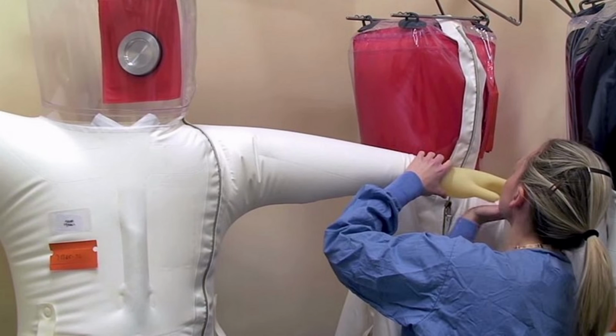Alternatively, this is where those jumpsuits come in. It's a full-body suit with air supply going into it, and there must be positive pressure. This means the suit is constantly being pushed out and away from your body. If, for any reason, there is some sort of damage to the suit, air will be pushing whatever's trying to get into the suit away from it and out of that hole. Exactly like a balloon being punctured, or a ball or car tire with a small leak in it. Air constantly comes out and pushes things away from the suit, meaning nothing can enter it.